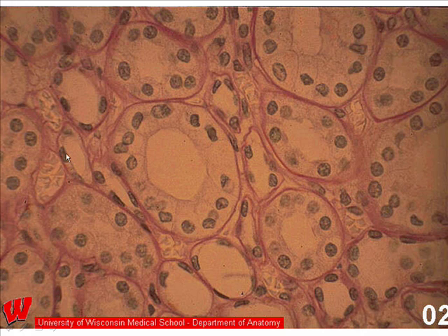So you can see four different epithelia. You have your squamous cells that are the endothelial cells, and this is specialized nomenclature for the blood vessels. Then you have your squamous epithelial cells for the thin loops of Henle, and then you have your cuboidal epithelial cells, and finally your columnar epithelial cells.